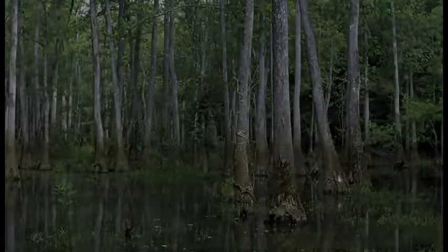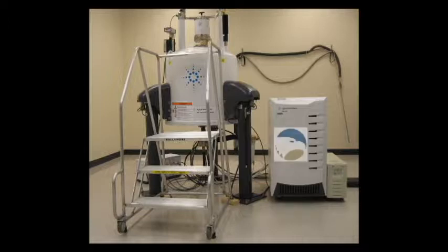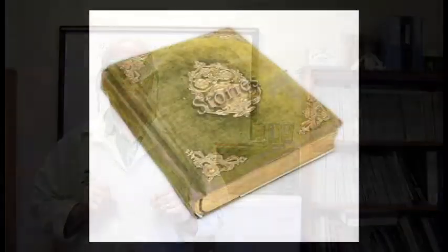But wait, the situation gets even worse. Meanwhile, in the wilds of South Georgia, time has passed, and our researcher, still dashing but now aging gracefully, has been working on their new 400 megahertz superconducting NMR. I've just run methanol on our new instrument, and now the methyl group has a resonance of 400 megahertz. So I'm going to update that value and get a new publication. Meanwhile, I just had my postdoc run that methanol in this 900 megahertz bad boy, and we got the methyl group out there at 900 megahertz now.